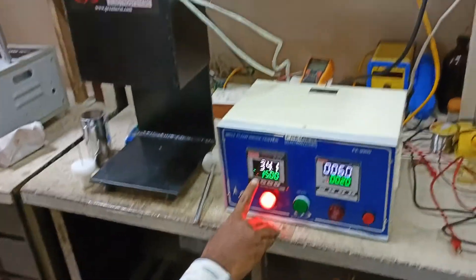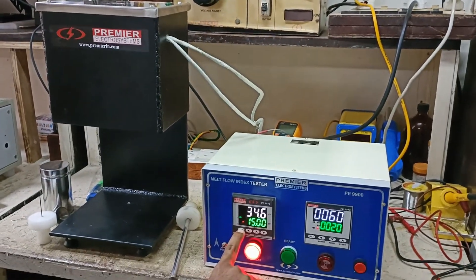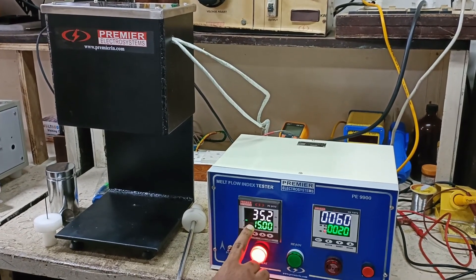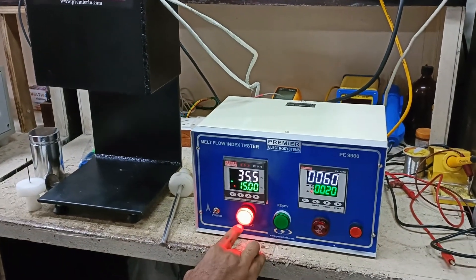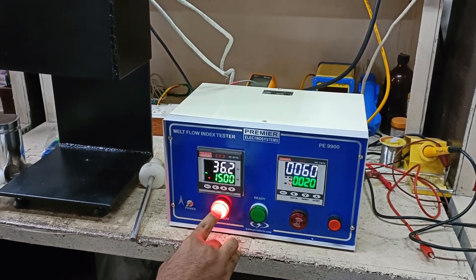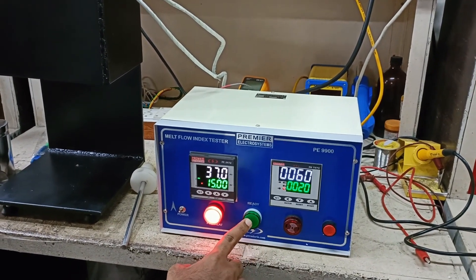In this unit we set the temperature to 190 degrees Celsius and we need a preheating period of 15 minutes, so all that is set in this. When the preheating is going on it will indicate the red LED. Once the heating is completed and the unit is ready to be used, this ready LED will glow.